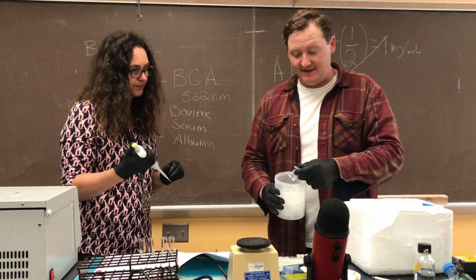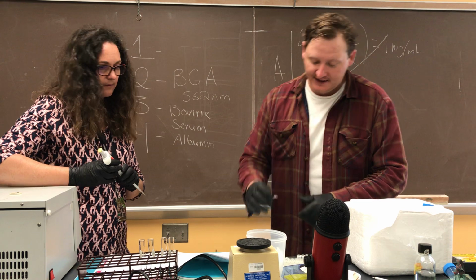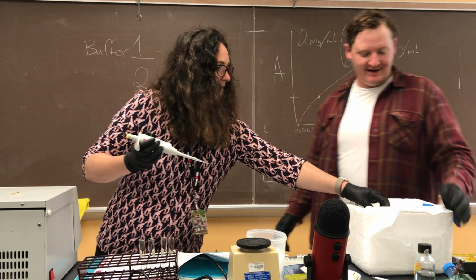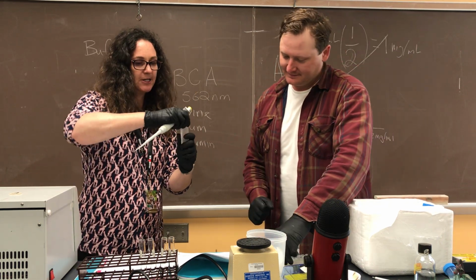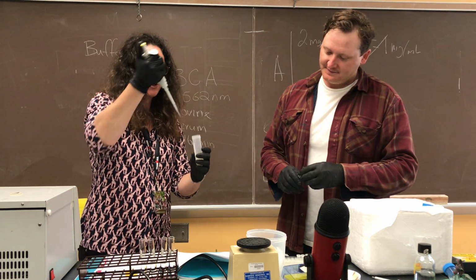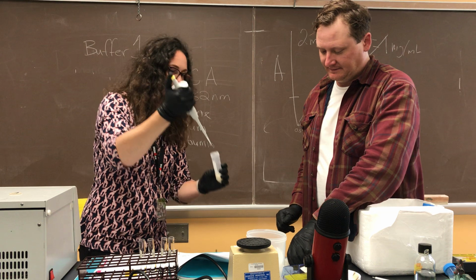So a classic way of concentrating things out of a solution, or out of a mixture to be accurate, is with centrifugation. So that's what we'll be doing right here. Alright, so here's the culture of E. coli. I'm using the P200 again, set on 200 microliters. Perfect. And I'm going to aliquot 200 microliters into each of the 4 tubes.